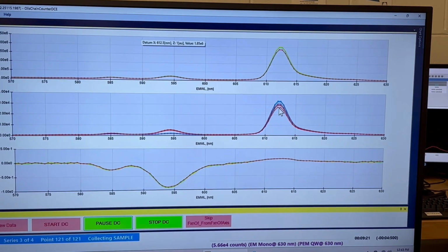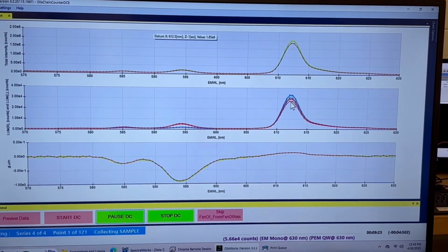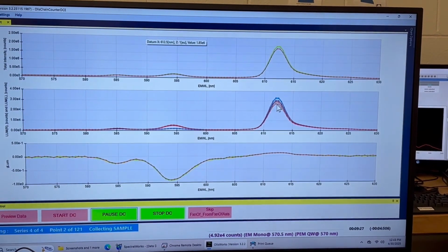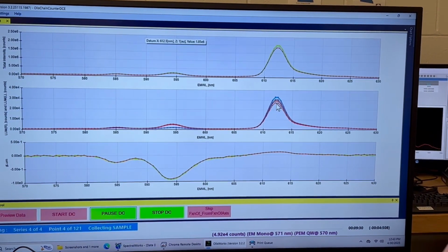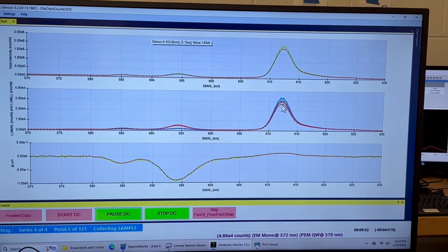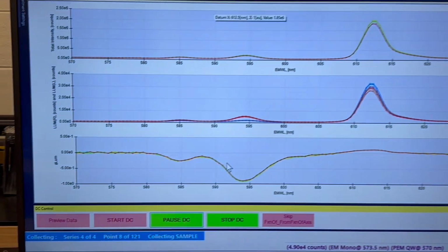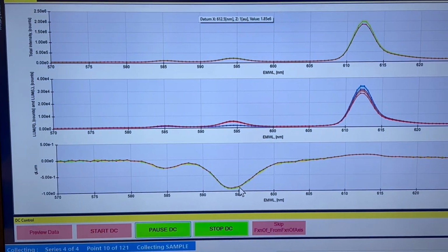When I added only 10% or so water, it didn't seem to make any difference. I had to go to a good 20% water before I see it. And notice the g-lum is hardly changing.